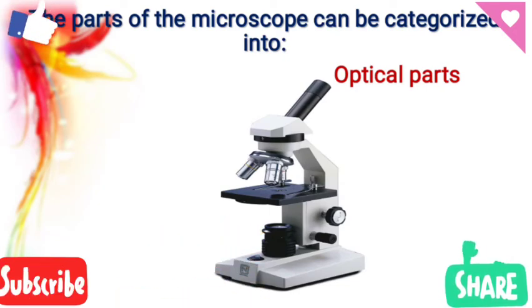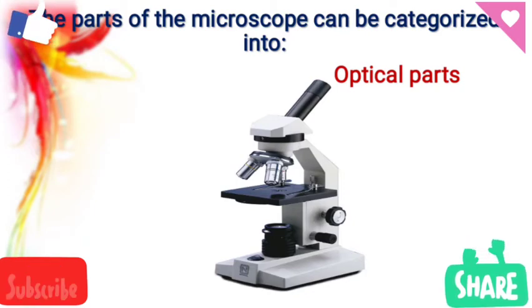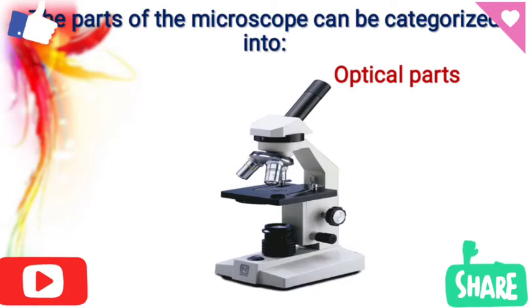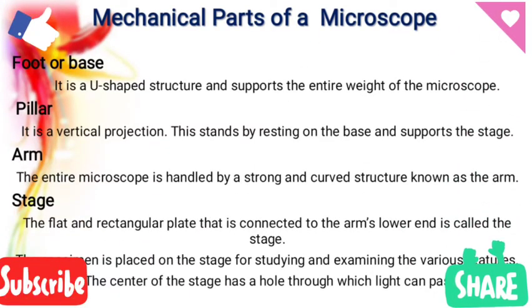We have seen the parts of the microscope. Now let's begin to see all these parts in more detail. Let's study it and make ourselves understand how all these parts help in observing a specimen. Mechanical parts of a microscope.